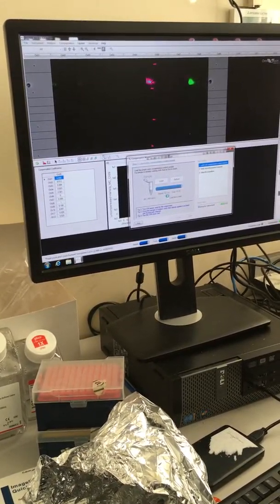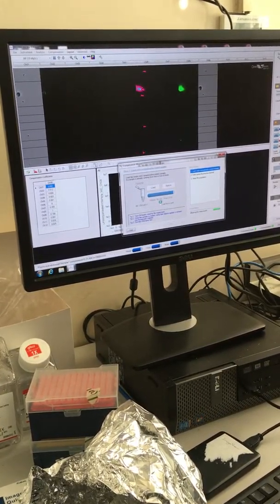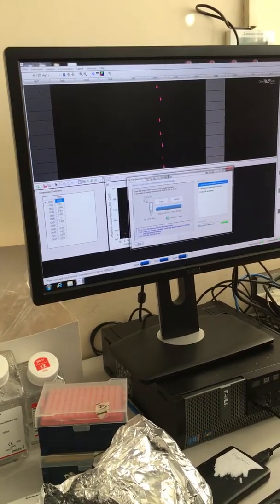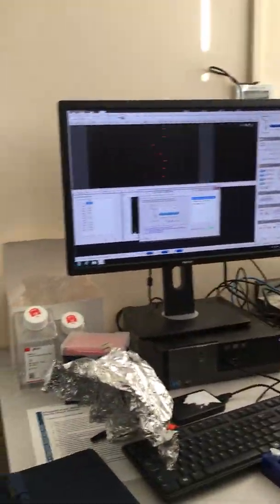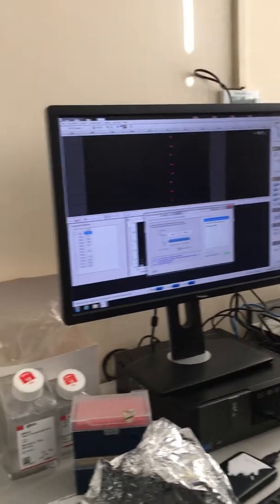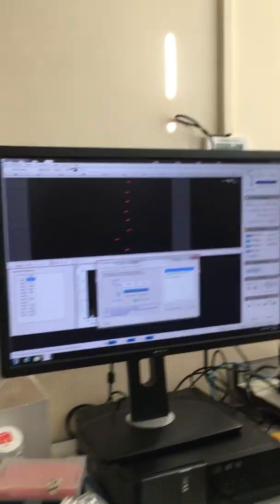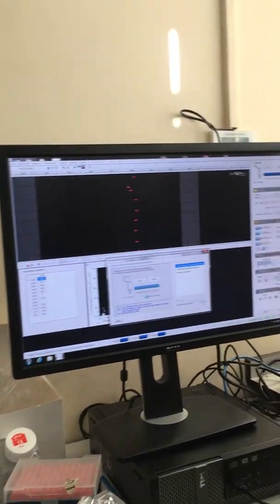Okay, the volume is 32. It's not as much as the live dead volume, but you've still got 87 minutes, so you're over an hour. That's fine. The minimum is usually 15 microliters. Generally, you want to go as close to 15 as possible because you don't want your samples to take forever to run.